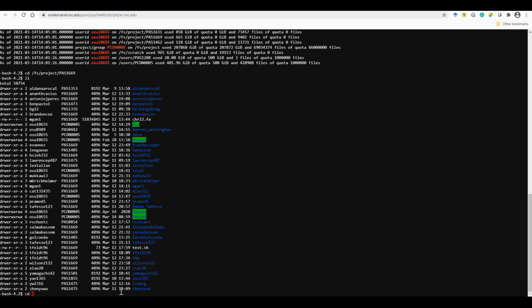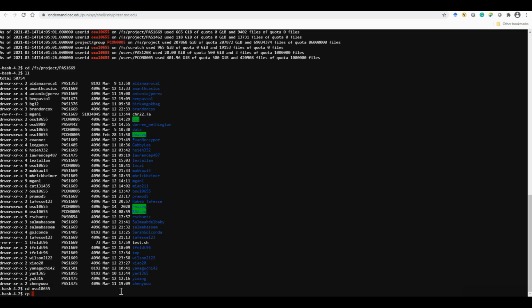So next, I will go to my own directory and copy, cp -r, the RNA-seq subfolder within it. Do not copy the whole folder because there are some huge data sets within the RNA-seq data folder. I don't want to waste too much storage space.